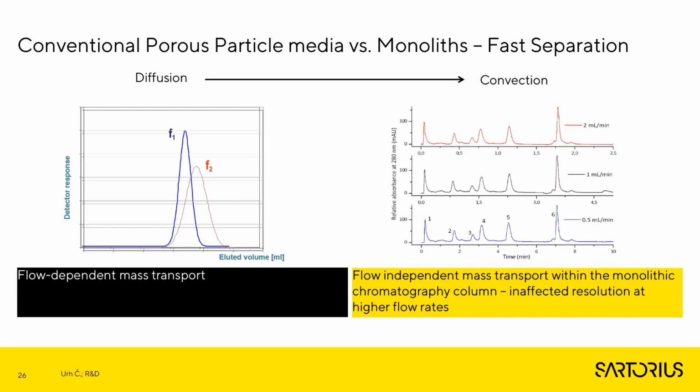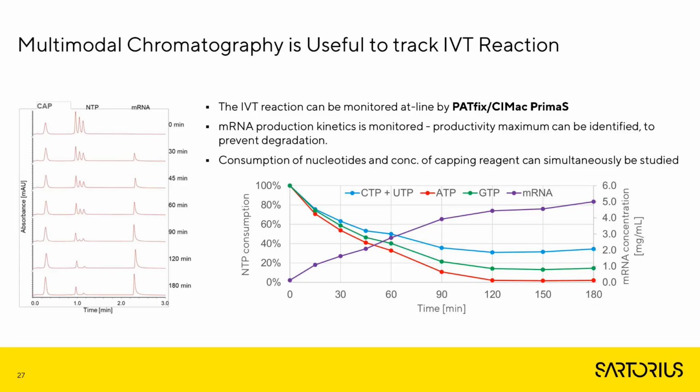And in context of mRNA, which is produced out of building blocks, the NTPs, templated by DNA, we've, I believe, pushed this to the limit where we can now resolve our IVT components, NTPs, mRNA, plasmid DNA, and capping reagent in less than 3 minutes. In less than 3 minutes, I think this is the fastest analytical method available for this work in the world.